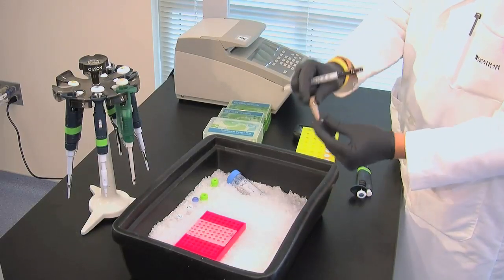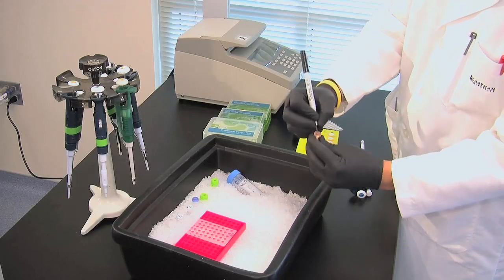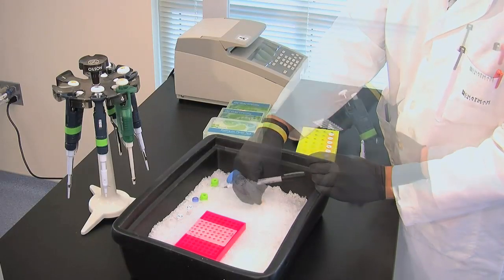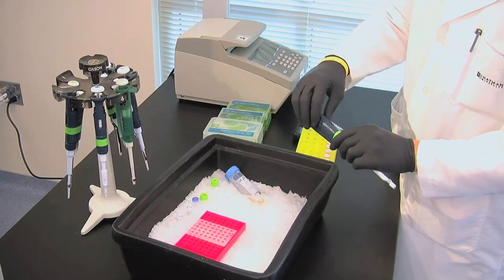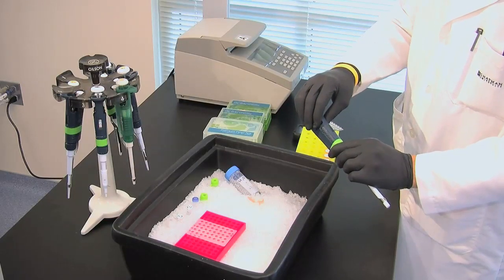First, prepare a tube for the master mix and label it. Then, put in water. The amount depends on how many samples you're going to use. In this case, we're using 318 microliters of water.